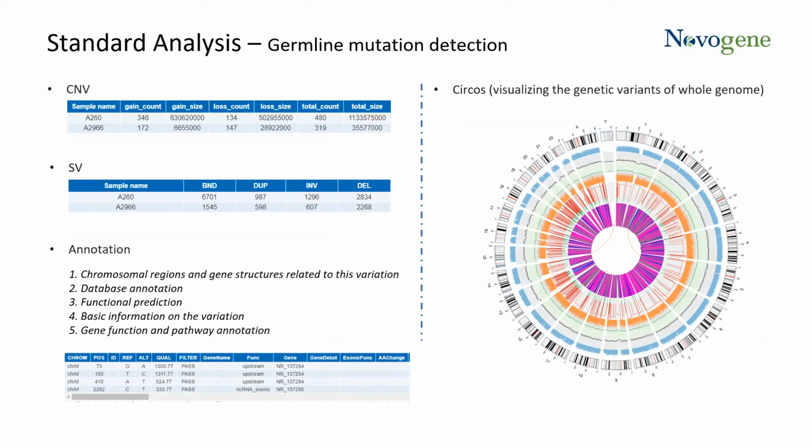Copy number variants are genetic variants that lead to variation in copy number of relatively large fragments, usually longer than 50 bp, between individuals. There are two types of copy number variants: gains and losses of copies, obviously. CNVs may form the underlying genetic basis of individual differences and cancer. You can see the table provided by us with the data of our experiment on the top left.